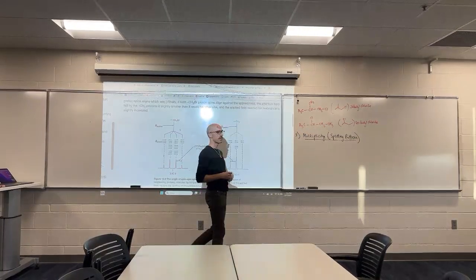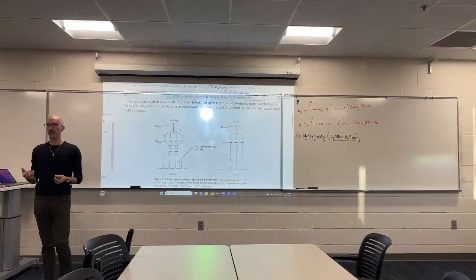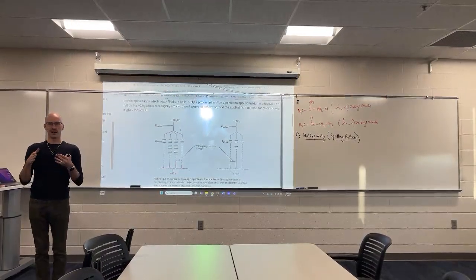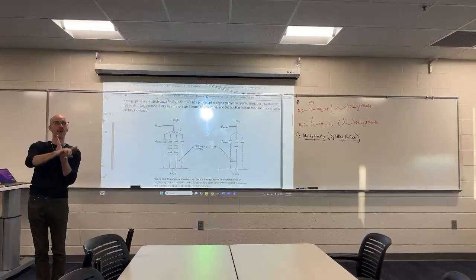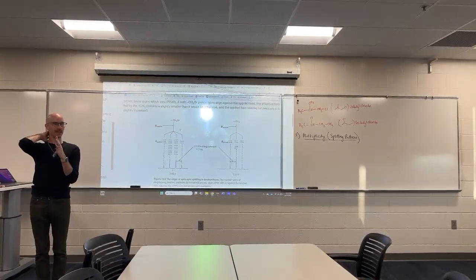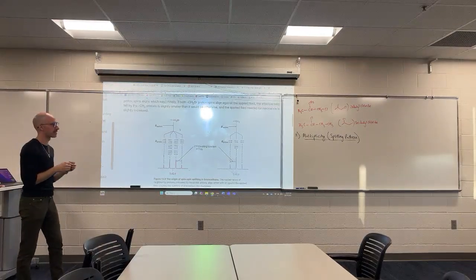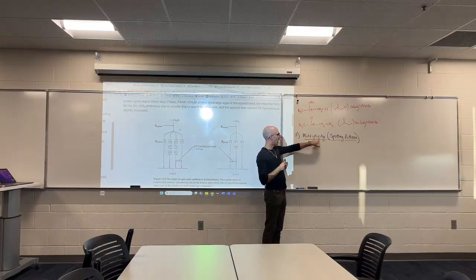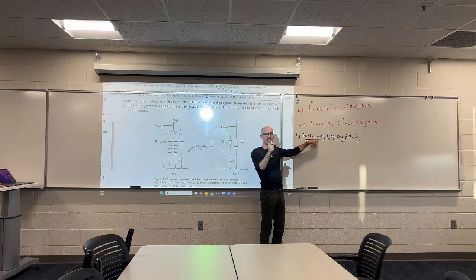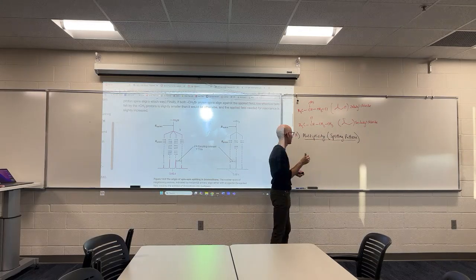And this is to explain why some of the signals you've been seeing are not showing up as a nice little line out of the baseline giving me a signal, but instead they're showing up as these messes, sometimes with all of these peaks. Why does a signal have multiple peaks? Why does it split into these multiple peaks?